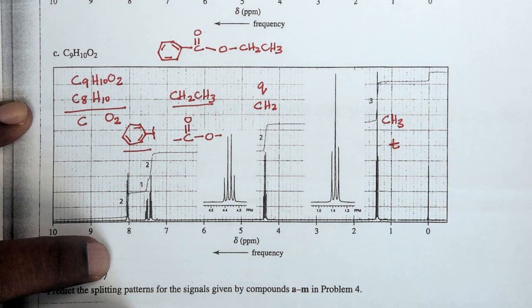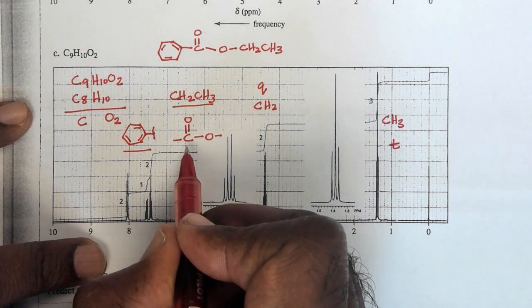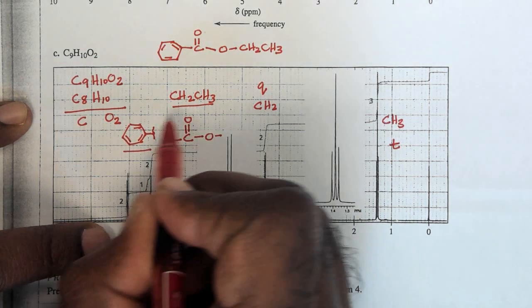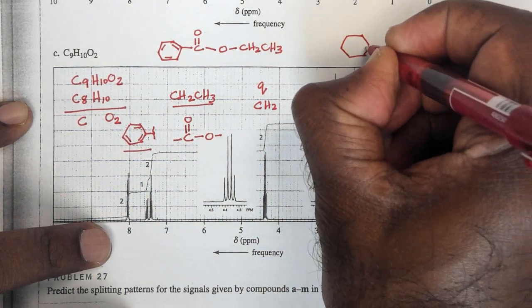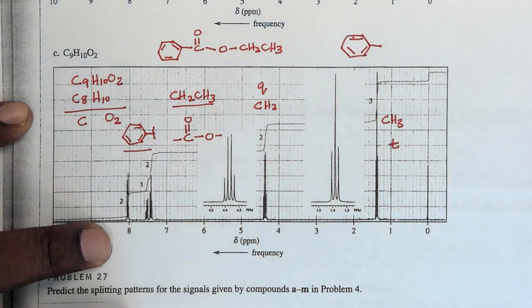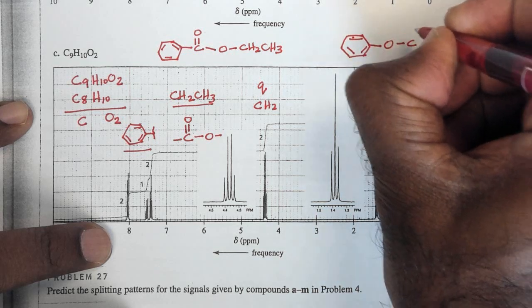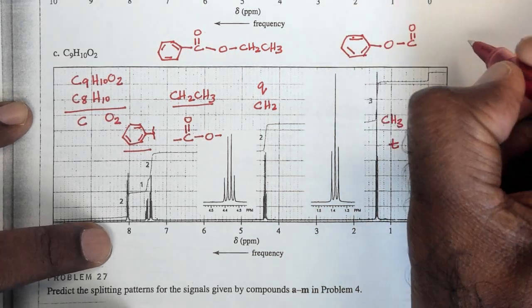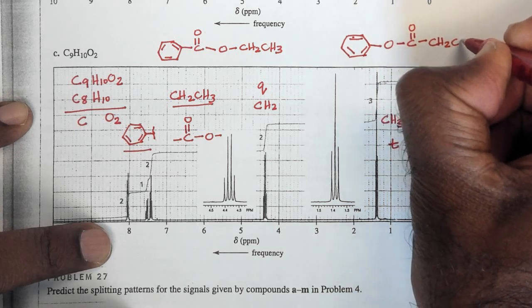What if I said, okay, I have these groups to join, let me try and join them in a different way. There's one other way I can actually join these together to make sense, but that won't satisfy the criteria of the spectra, and I'll show you why. I could put the oxygen there, the carbonyl group there, and then the ethyl group to that.